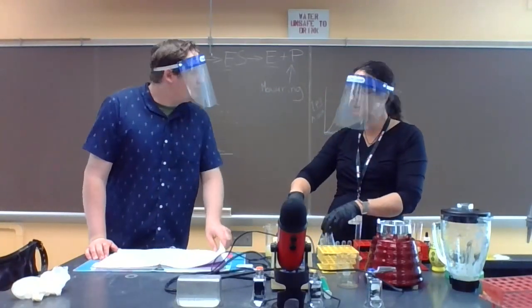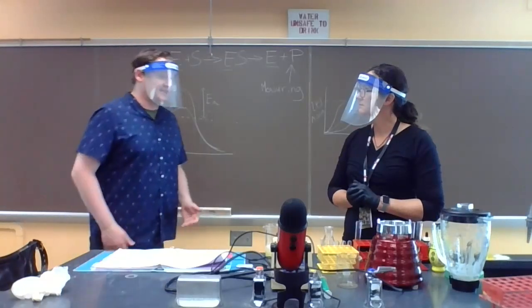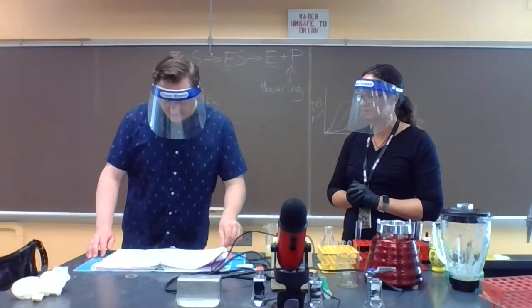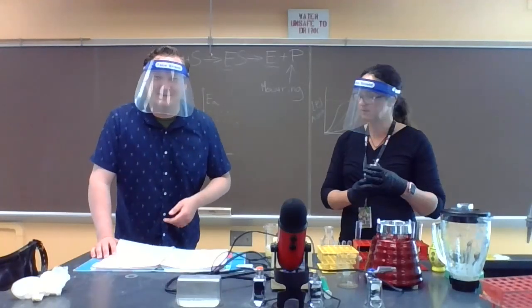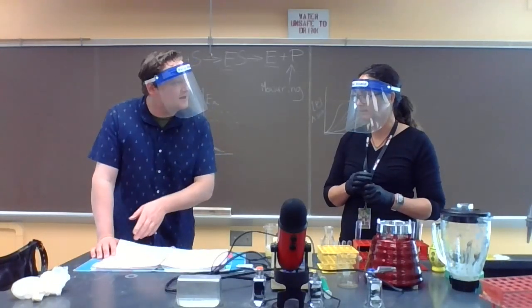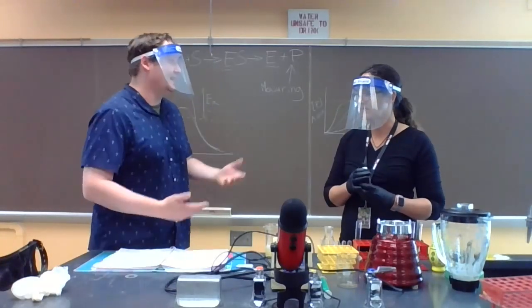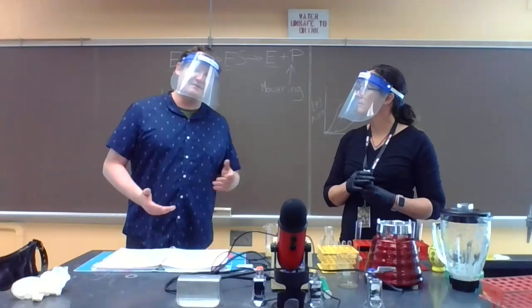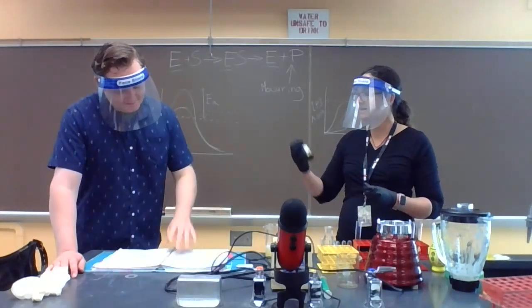So we will be adding in our own source of substrate, which in this case is catechol. You can see in the middle of your protocol for today's lab that catechol is what's actually converted into another molecule, giving it the brown color. And this reaction is catalyzed, as we've already talked about, by polyphenol oxidase. So catechol is the substrate.